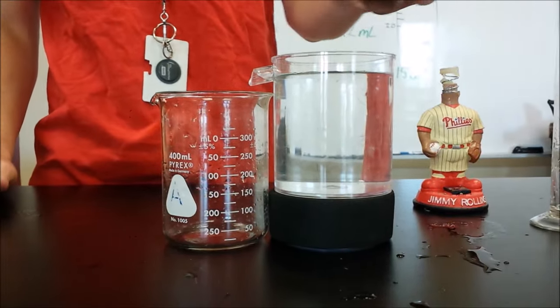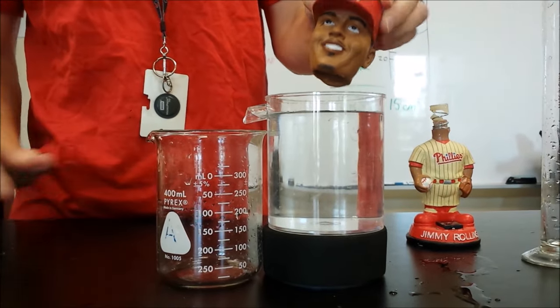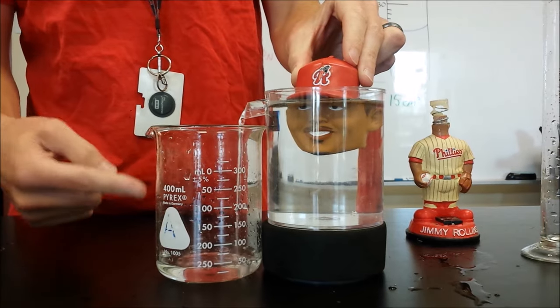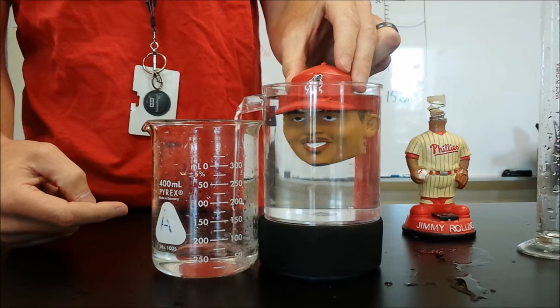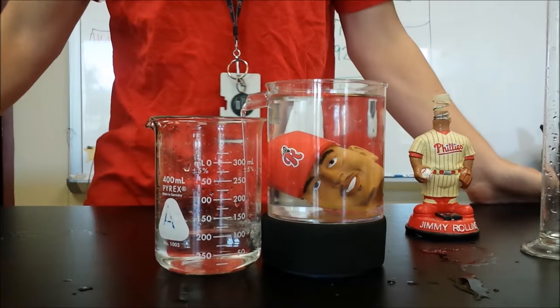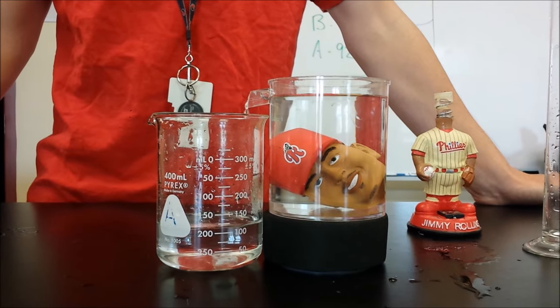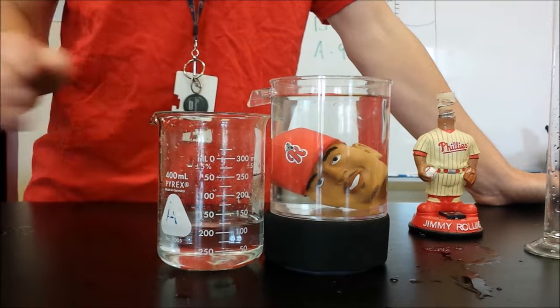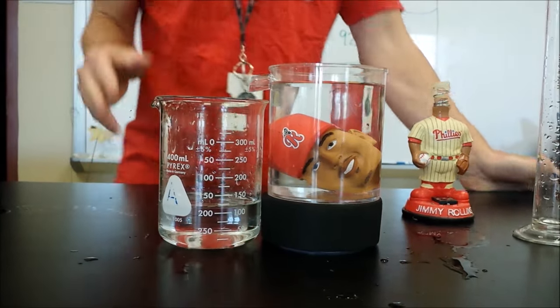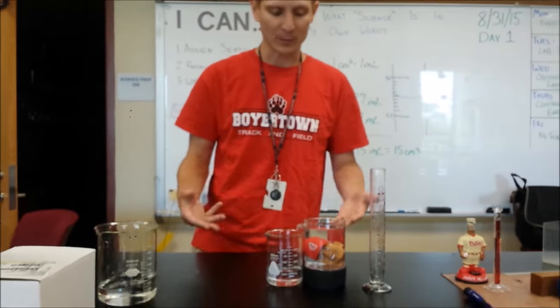So now we're going to take Jimmy Rollins' head, and we're going to place him into the overflow can, and we're going to go very slowly. If we go too fast, we're going to have water splash out, and we won't be getting a very accurate measurement. So we're going to place him in slowly. All of the water that he displaces is being caught into our catch beaker right now. Okay, so we've caught all the displacement into our catch beaker, and now we're ready to measure the displacement, which is going to tell us the volume of Jimmy Rollins' head.